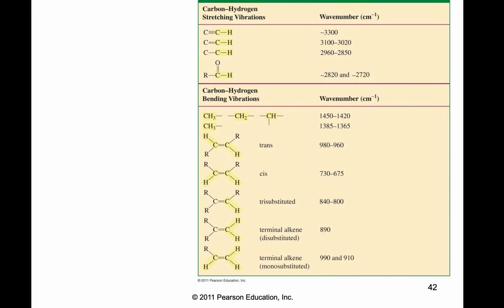The most valuable technique for knowing right away if you have cis or trans in an alkene is to run an infrared, because you can detect as little as 0.5%. Now, you know how they talk about 'contains no trans isomers' with potato chips and other things because of the catalytic hydrogenation? Well, if you contact a cis alkene with a cheap catalyst like nickel instead of platinum or palladium, that catalyst with heating can isomerize and convert the cis into the generally more stable trans alkene.